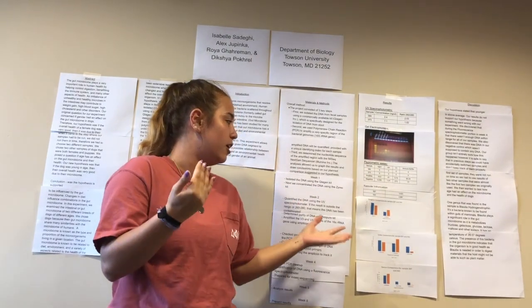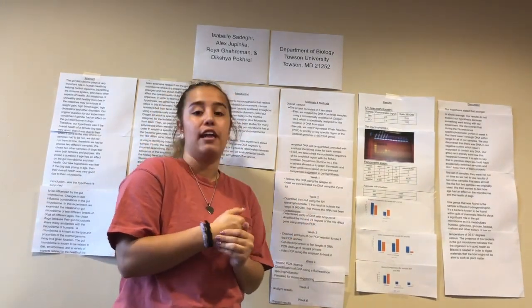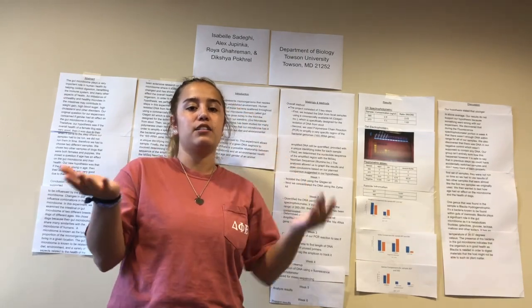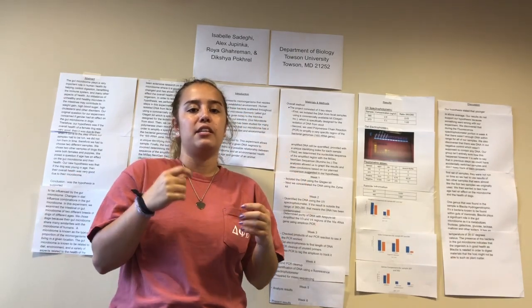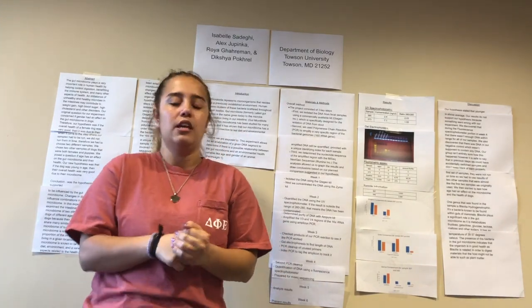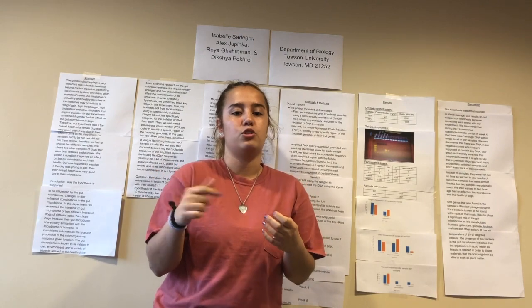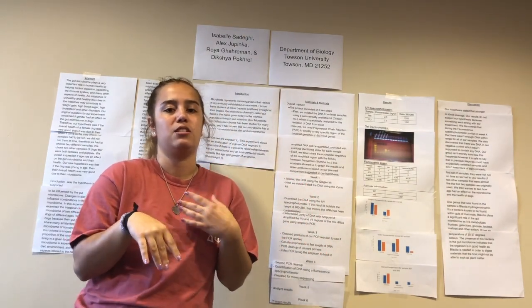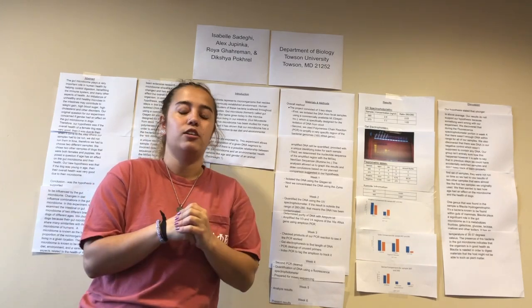So between our categories of other and unclassified, the other category were reads that could be classified but were present at less than 3.5% of the total reads and thus were not considered important. The unclassified category are ones which do not match any known organisms at the kingdom level and likely meant that the reads were errors.